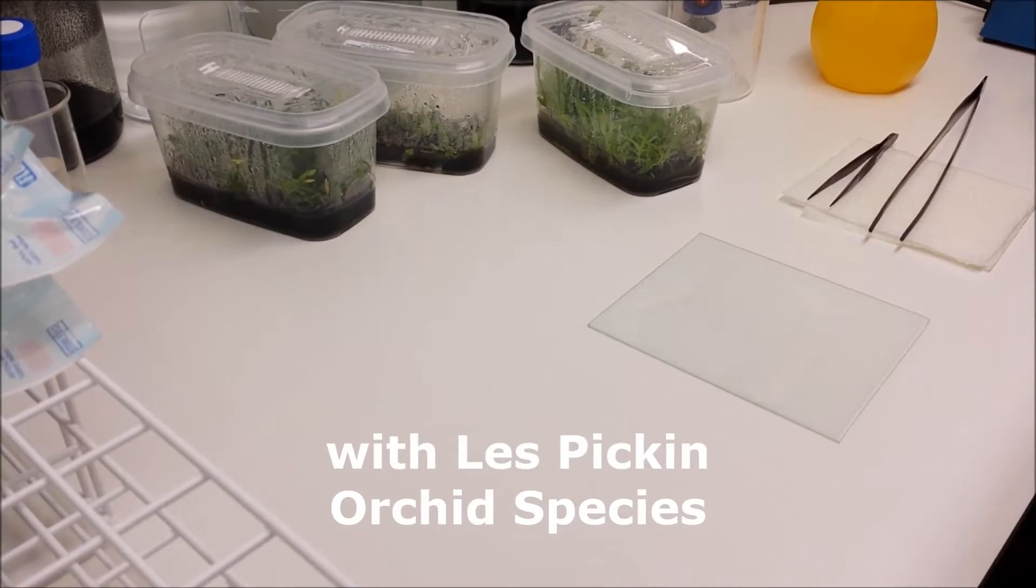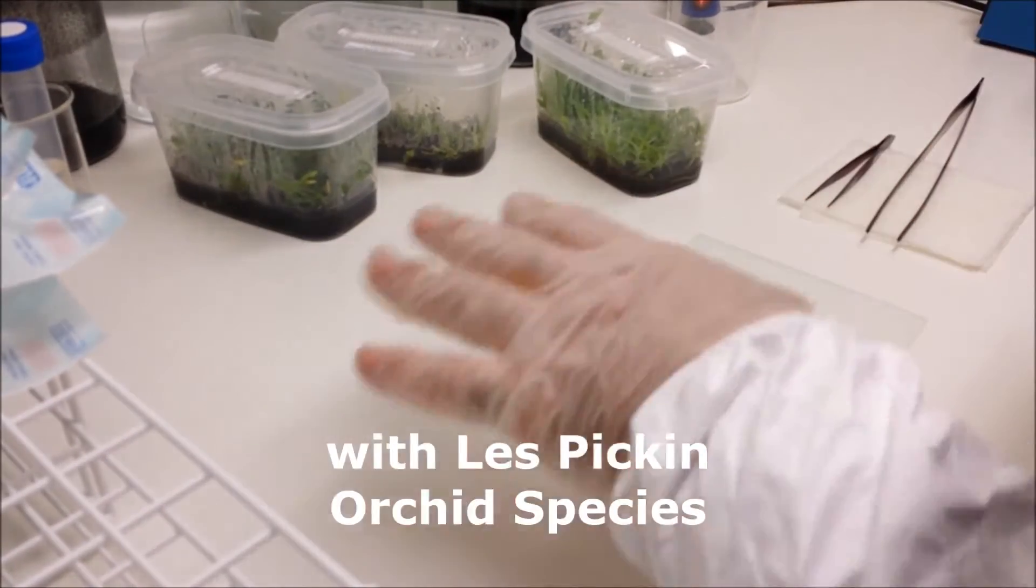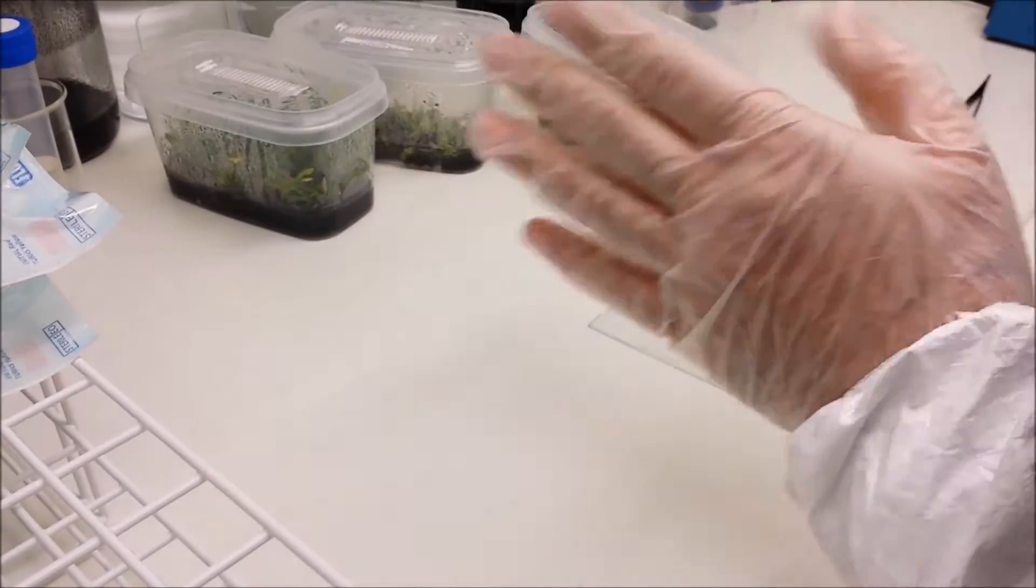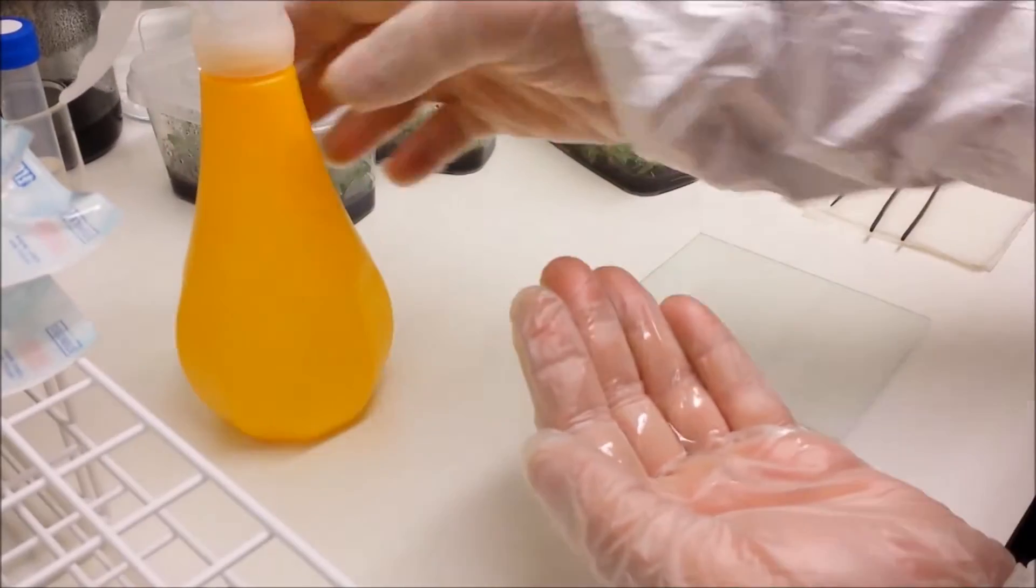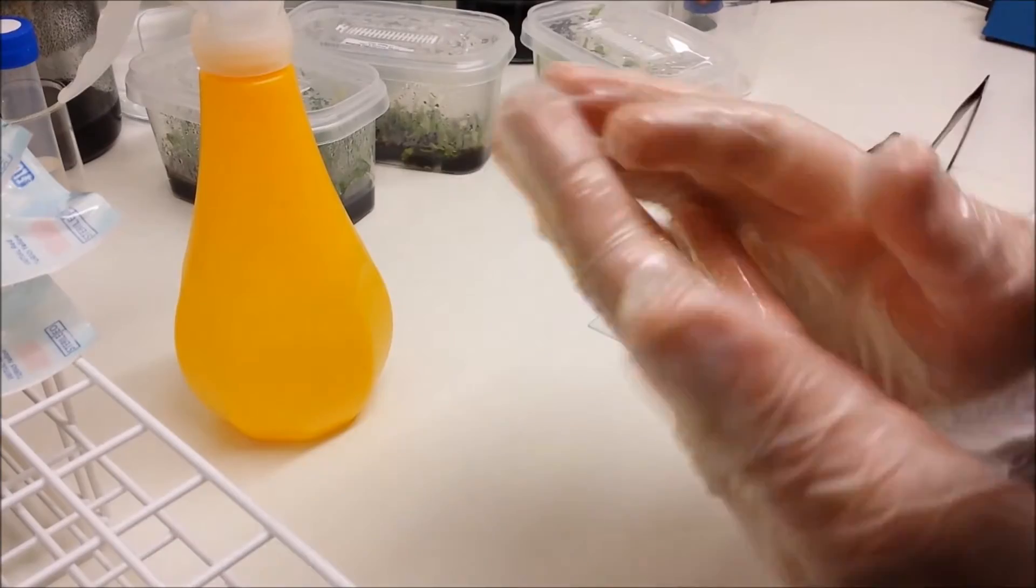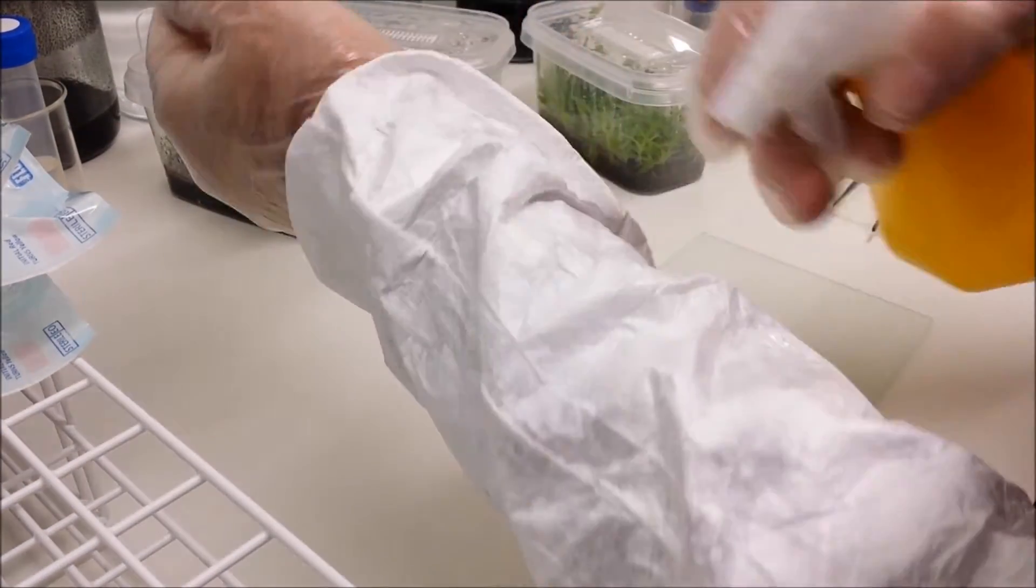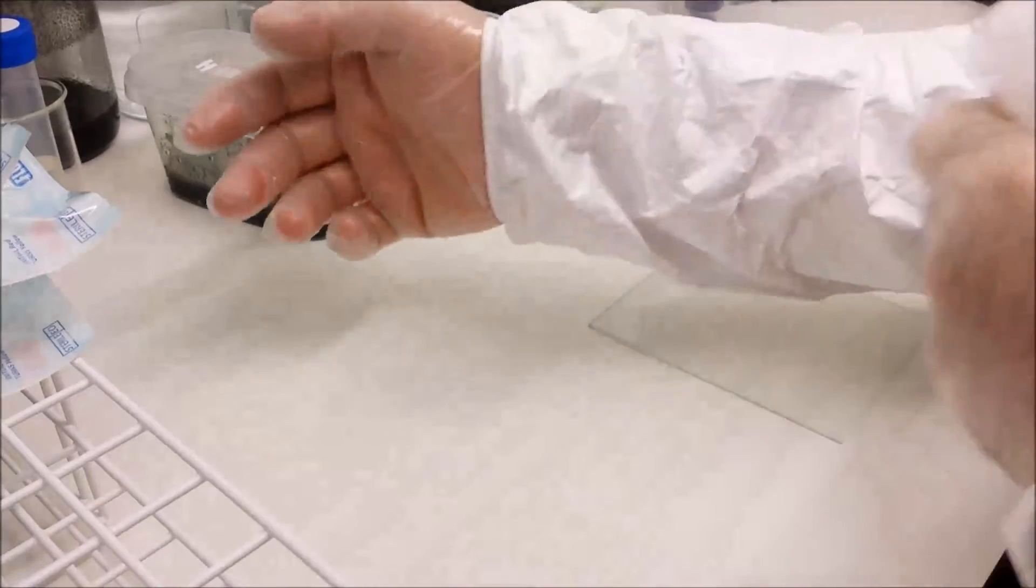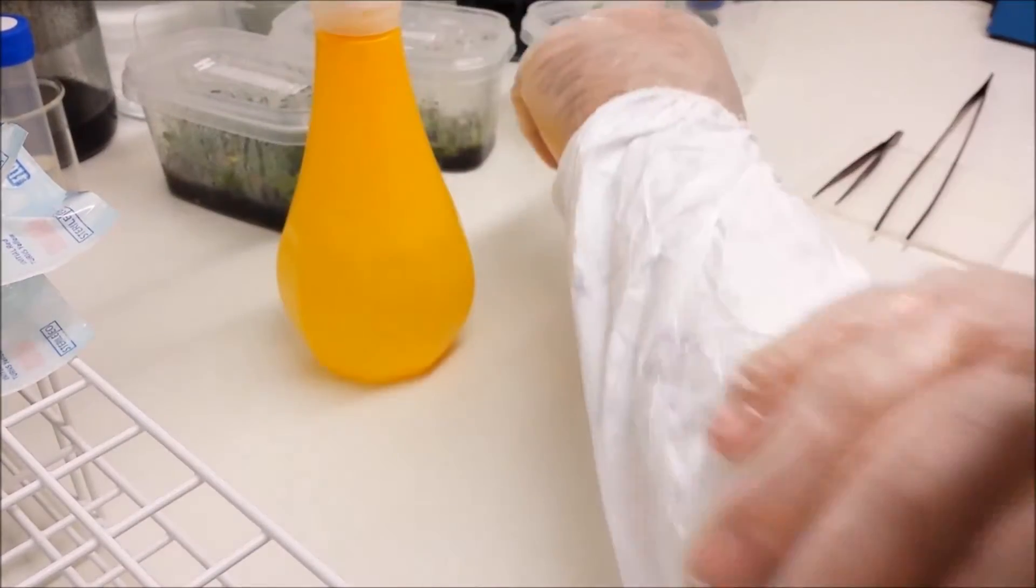Good afternoon folks, it's Les from Orchid Species. The first thing I'm doing today is I'm going to remind you that you should spray your hands with isopropyl alcohol, as well as the work surfaces, utensils and any equipment that's inside your sterile area. As you can see I'm wearing some surgical gloves, I'm also wearing some arm covers because I've got quite hairy arms and I'm spraying those with isopropyl alcohol.